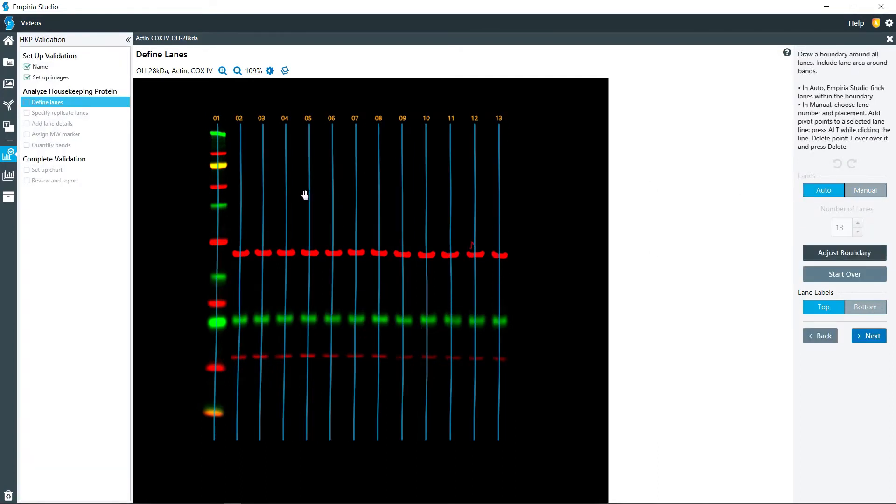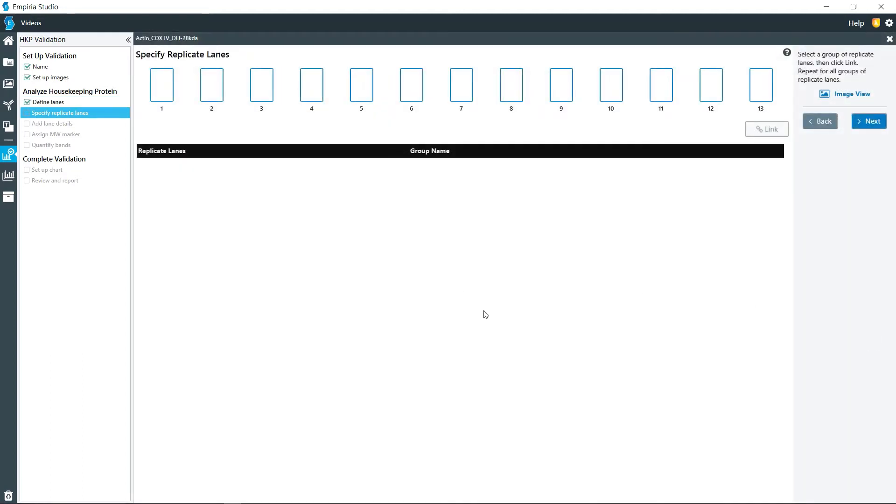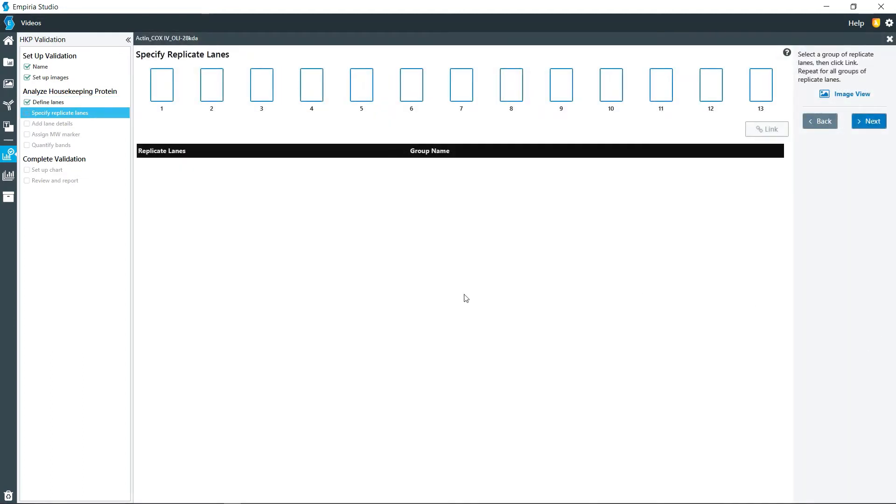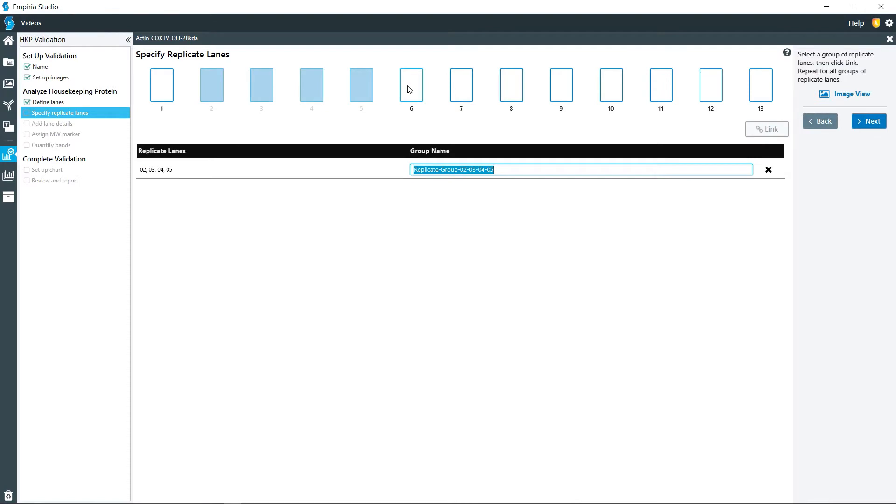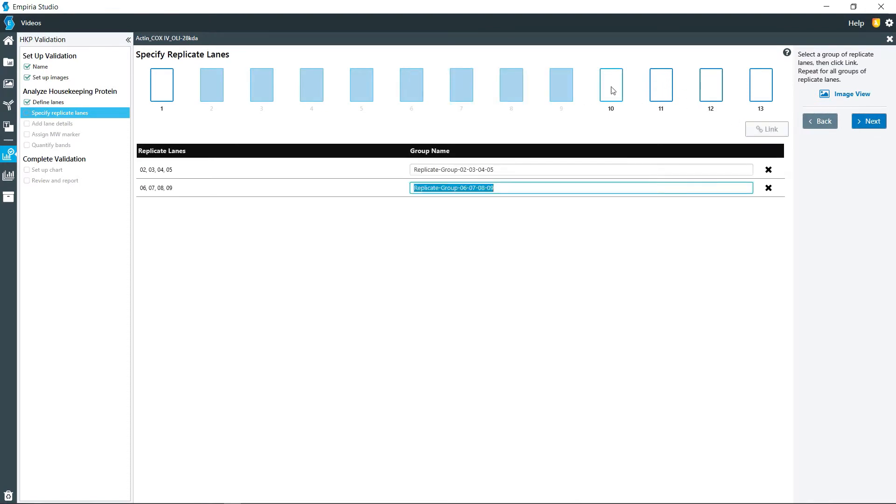So what you are looking for is that the line is going through the middle of the lane. Click next, then we have some replicates on here. So I'm going to click on those four lanes, as they are all the same replicates.